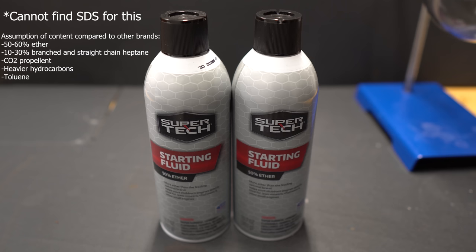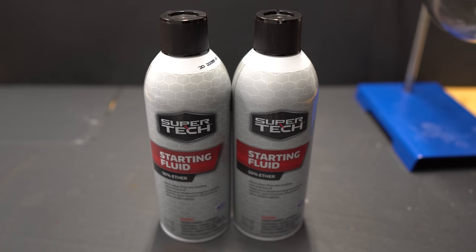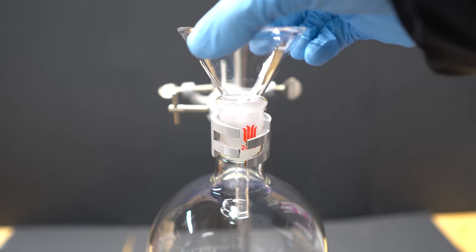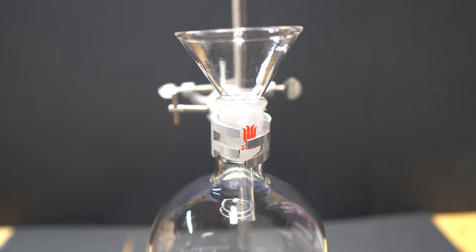So we're going to extract heptane and diethyl ether from starting fluid. We're going to use the 50% ether starting fluid just because we can get a lot more out of it compared to the 20% one.